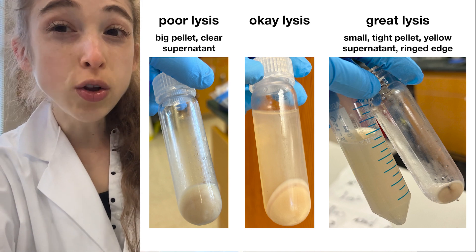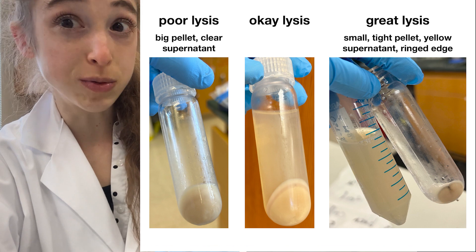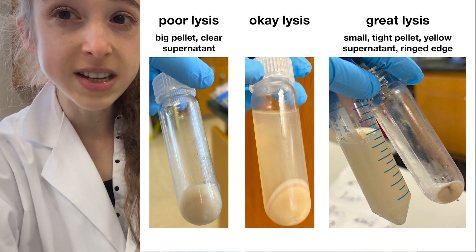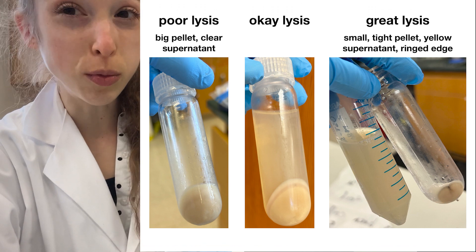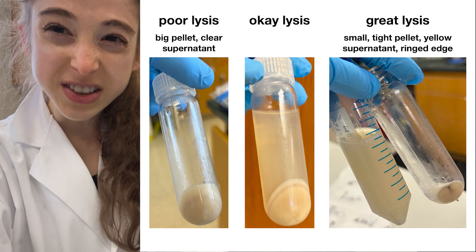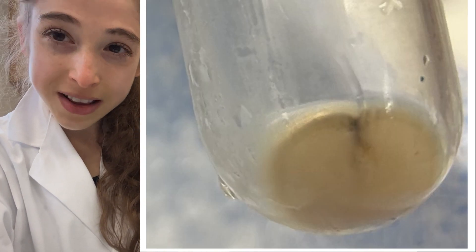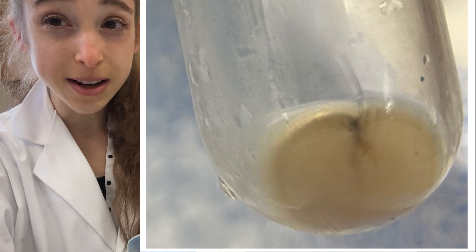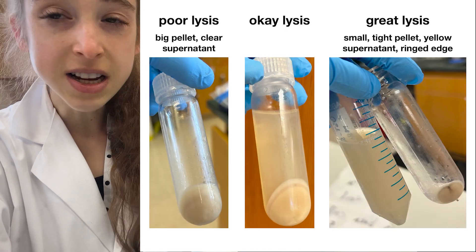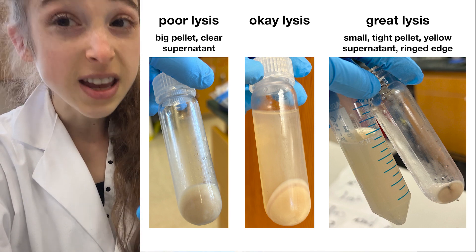Protein purification tip: look at the pellet post-lysis to see if the lysis was successful. If the cells broke open well, the supernatant will be kind of yellowy, and you'll have a nice tight pellet. Often it'll have rings around it with different layers of stuff, and on the edges it'll be kind of shiny. This nice small tight pellet is a good sign of successful lysis.